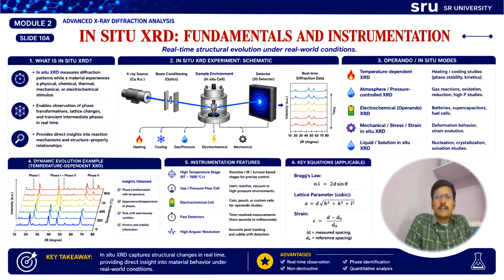Another important aspect of this in situ XRD is time resolution. The modern synchrotron based XRD systems can capture diffraction patterns within milliseconds, enabling ultra fast structural analysis.